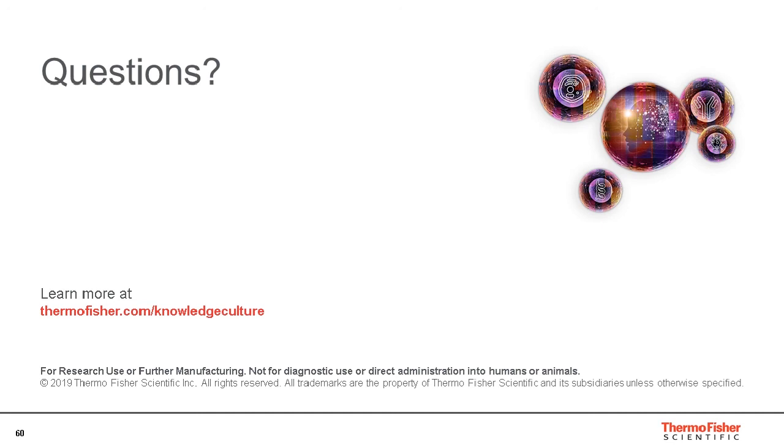And finally, why is adherent cell culture your process type of choice? 50% of you answer that it's necessary for the virus you're producing, which is very common. And secondly, the high cost of transitioning to suspension is hindering some of you in your change from adherent to suspension.